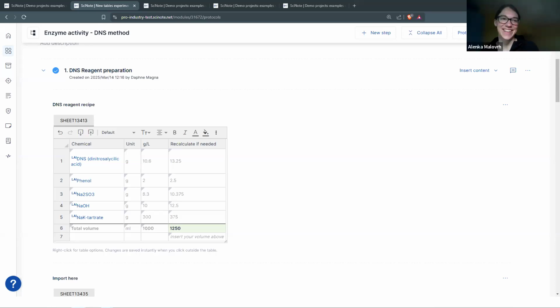So yeah, do you want to take that? Yeah, I can take that, because I think I know which customer this is, because I worked with them on the report in the previous year. So yeah, for the tables that you have inserted in steps as tables, they all are updated with this new release, so with this new feature.